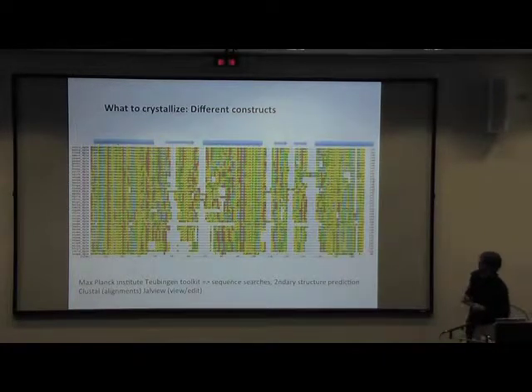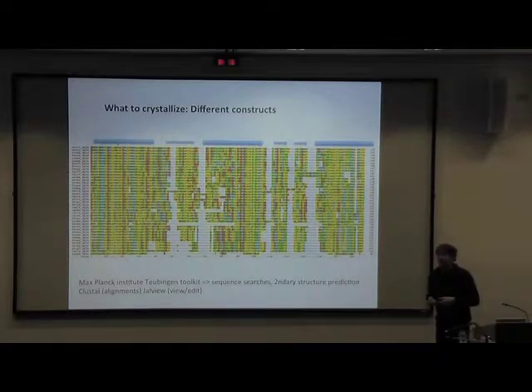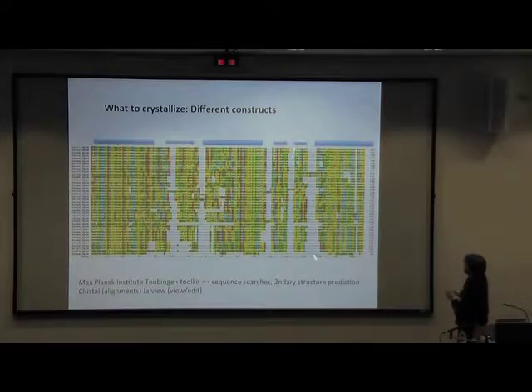And there's another reason why it's useful, which is that it also gives you some information on domain boundaries. So you can see there's all these gaps in between the different sequences, which means that evolution has put some extra residues in here, or maybe removed a few, and that may give you some indication that maybe this is the end of a domain. So possibly if the conservation is a bit poorer here, maybe we're going to truncate it here and only express this bit, or the other way around.